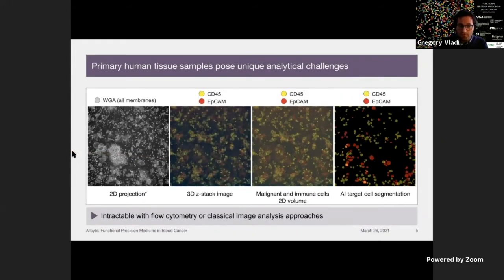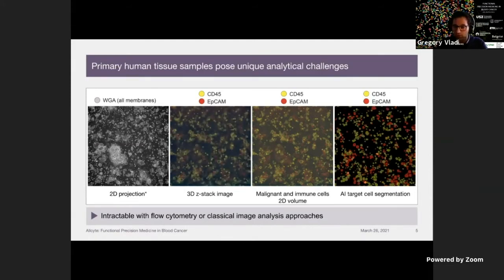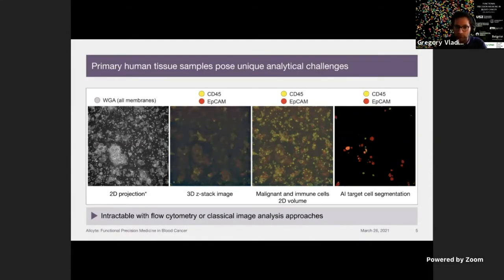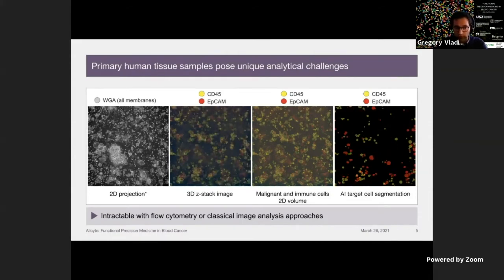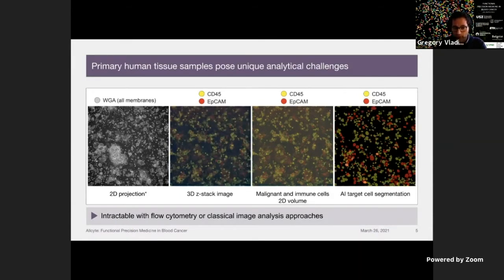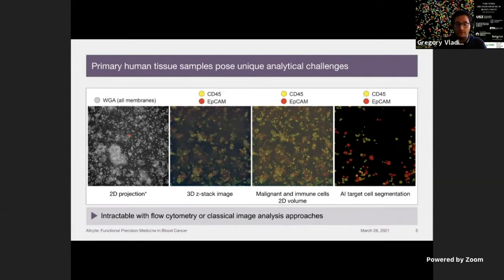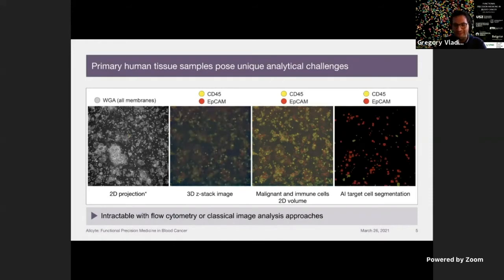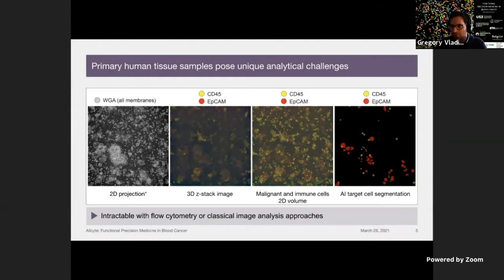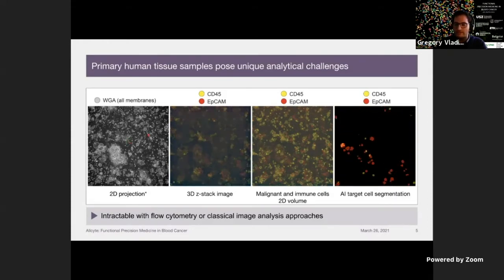So for single cell segmentation and classification and phenotype quantification, we turn to custom deep learning driven image analysis toolchains that we've created in-house. And I want to show you an example of how we tackle some complex images. So this is actually a solid tumor sample. And in our solid tumor programs, we need to homogenize these tissues. Same goes for the lymph nodes in the hematology. But by creating a single cell suspension, we're likely introducing too much background cell death. And maybe something that's more amenable to flow cytometry, so single cell suspension. But what we want to do is only lightly homogenize these.